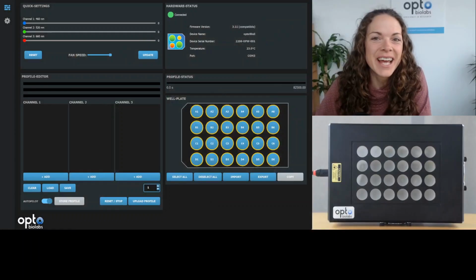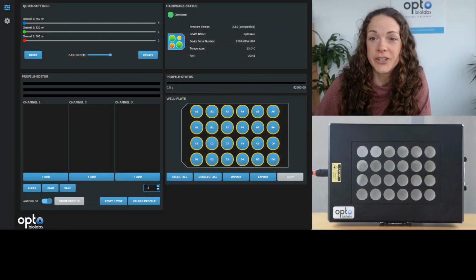Hi, if you're watching this video, you probably want to know how the new optoWELLControl software works. So let's dive right in. Your software should be connected.